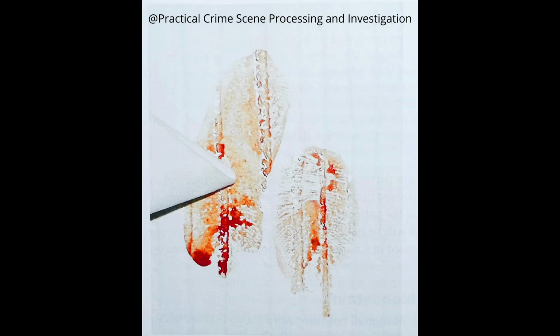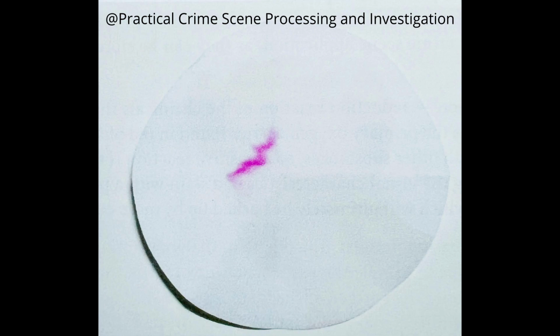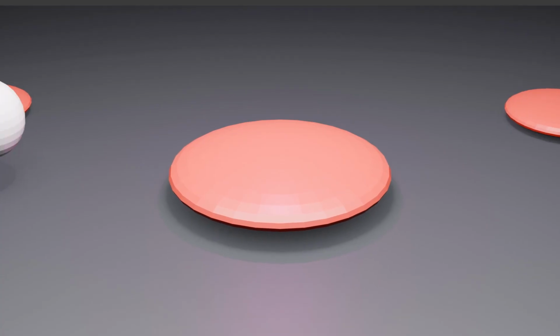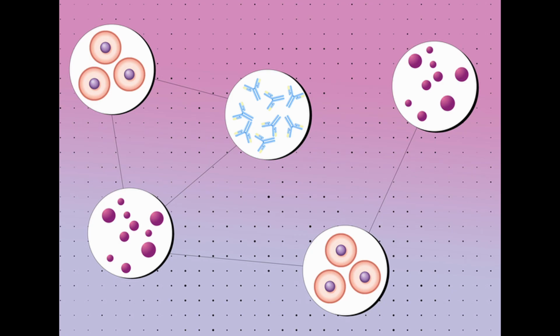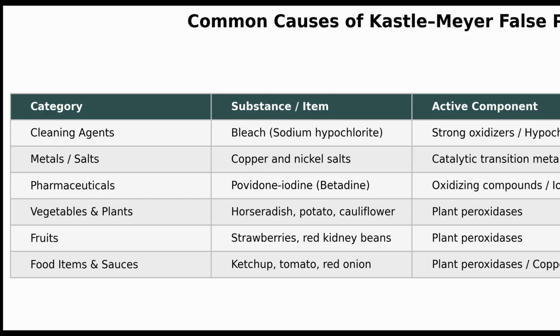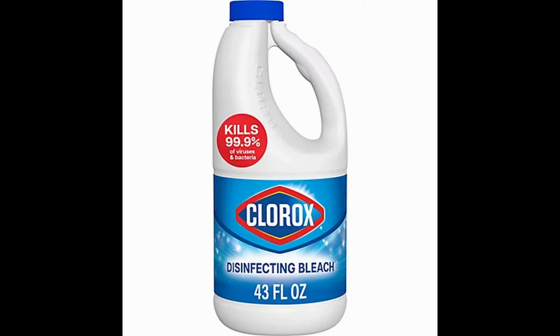The phenolphthalein test is regarded as a presumptive test only, and not a confirmatory test due to significant limitations. One of these limitations would include specificity issues. The problem is that heme mimics peroxidase activity. Therefore, any biological, chemical, or vegetable materials that undergo peroxidase activity could result in false positives. Examples that give false positive readings include horseradish, rust, and bleach.